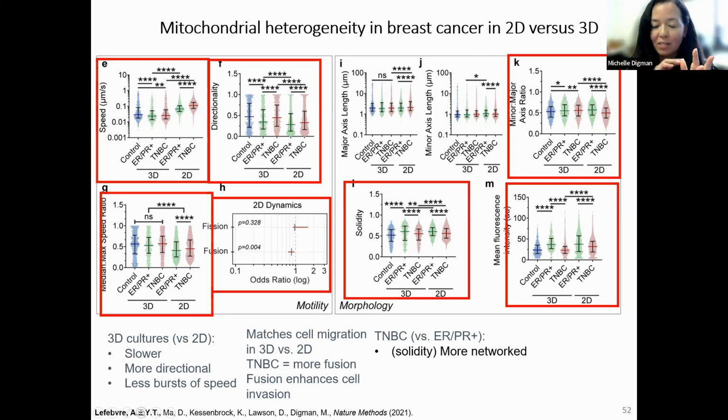And if we look at triple negative and ER positive cells, the network, because we have different parameters, we can not just track mitochondria and get the means for displacement, but we can also take the structure of the mitochondria and evaluate if they undergo more branching, if they're less branched, the axis, all of the features of the structure, including if they undergo fission events.